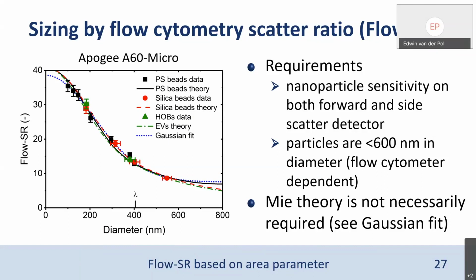Yeah, the silica beads are of lower quality. I will not mention the name of the manufacturer. But generally, what we do is we buy them. They are quite monodisperse, but we will apply electron microscopy ourselves to validate the size.